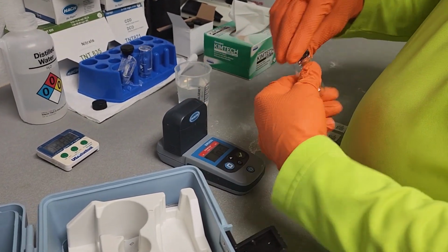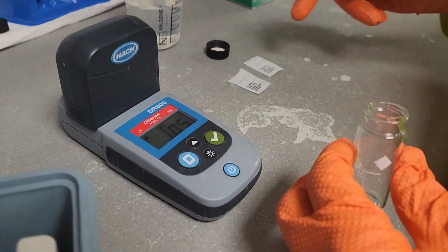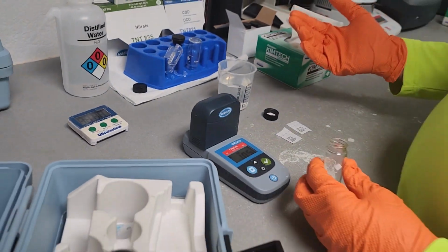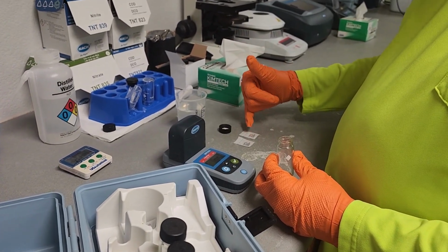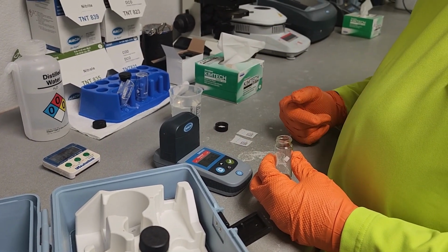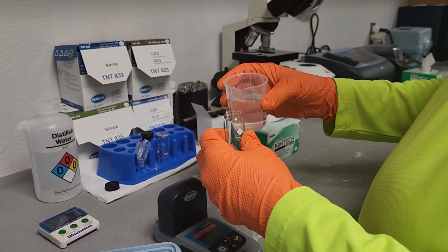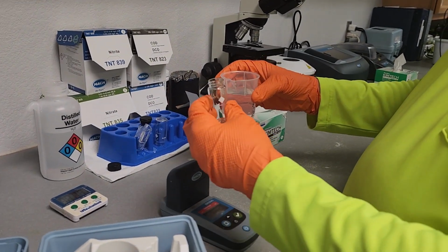So I have a sample cell. Oh, and I also have 2 DPD packets, one for free chlorine, one for total chlorine. So we're going to check this sample to see what the free chlorine residual is, and then check it for total. If we take the total, subtract the free, we should get a combined chlorine residual. So we're going to start by, now this is a brand new sample cell, but ideally we would take it to where we pull our sample and we would flush it out.